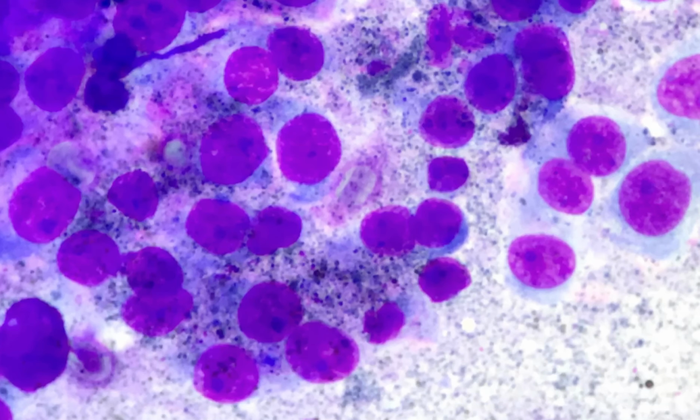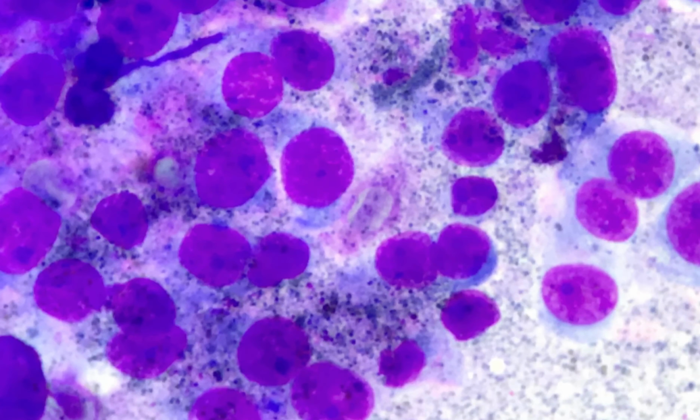And if you suspect that this could be amelanotic melanoma, then there is another stain called Fontana stain, which will actually help you diagnose amelanotic melanoma very well compared to normal stains like Wright stain or Diff-Quik, etc.